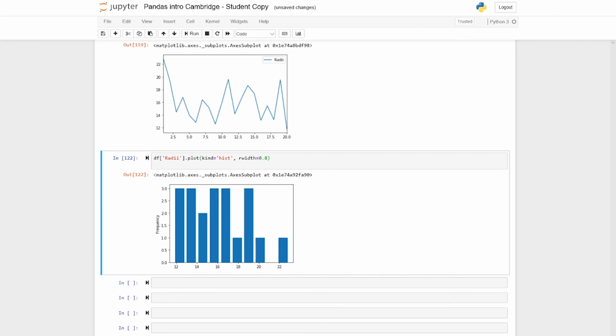That's about all I'm going to be covering in this particular section of the course. If you have time and you want to have some more experience, what I would suggest is doing the same workflow and working it up on the comma-separated variable results table you got from looking at the simulated cells. Everyone will probably get slightly different answers depending on the workflow you used in your Jython script, but it'd be interesting to see what you have.